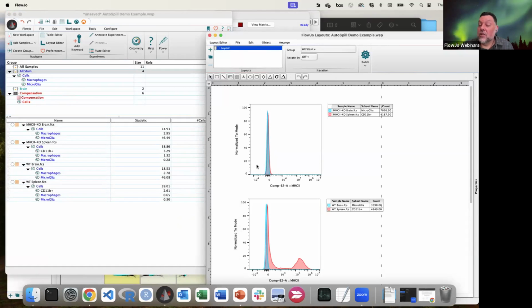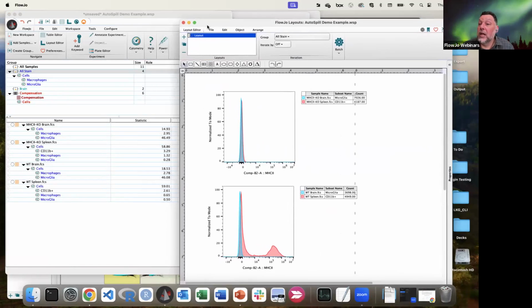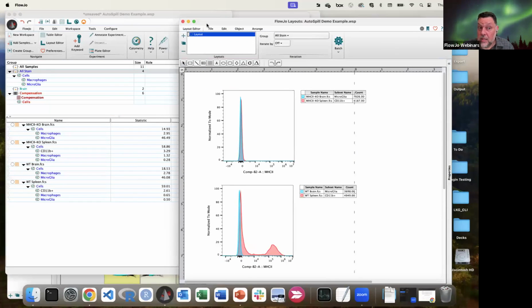And so that's the whole take-home point of that particular figure from the paper, is that autofluorescence subtraction works, and it can give you better, more biologically relevant results.